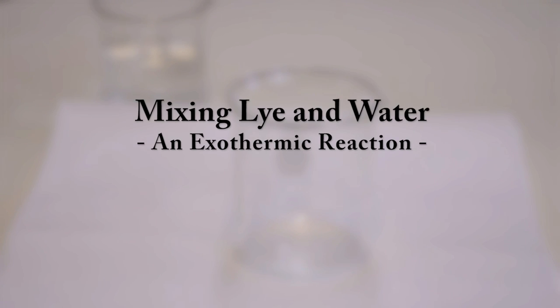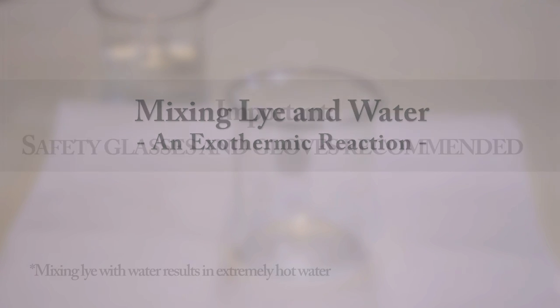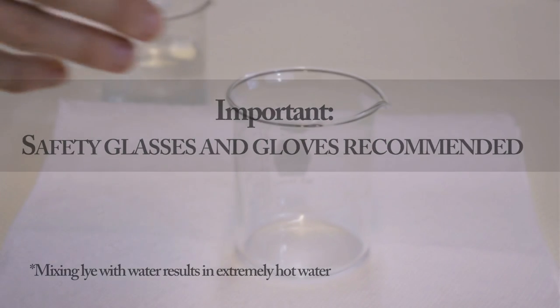Today in this experiment we are going to mix lye and water. Be sure to wear the appropriate safety gear. Now let's begin.